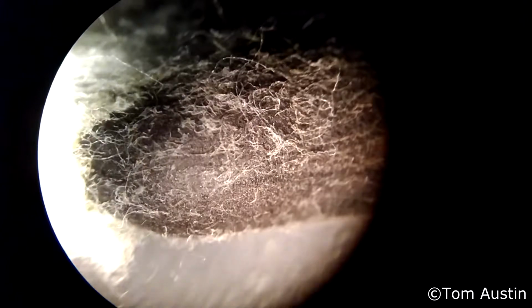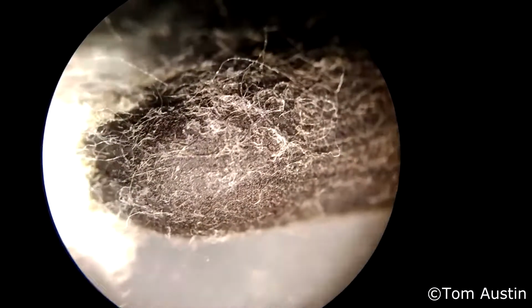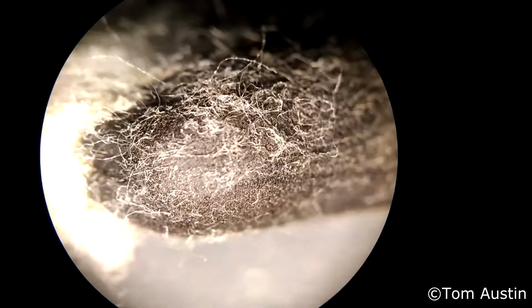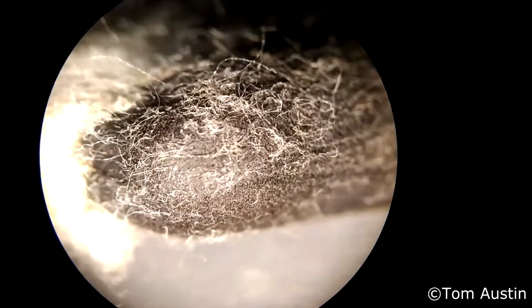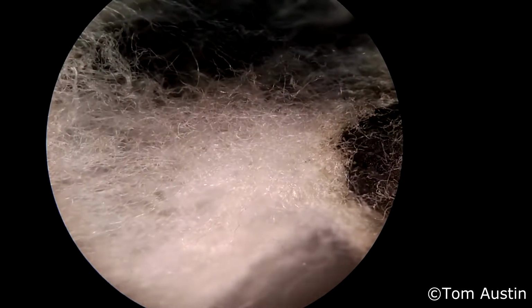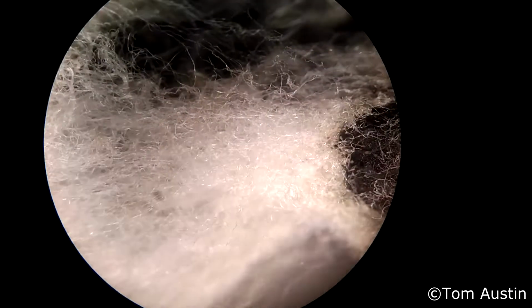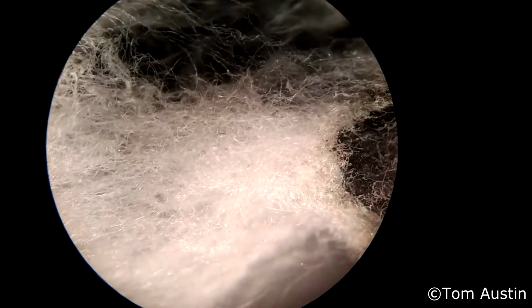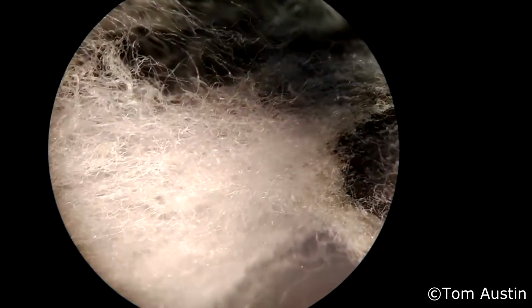Also, the helix seems to be a lot tighter. That's what's giving it that wrinkly quality. It also seems to be flatter. It's not as thick. It's not as cylindrical. It's sort of like a ribbon almost. Hopefully it should be a little more obvious now. I understand that it's rather subtle, all things considered, but this is just really wrinkly.